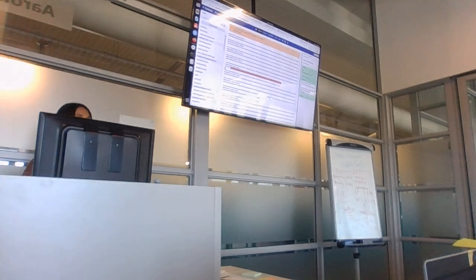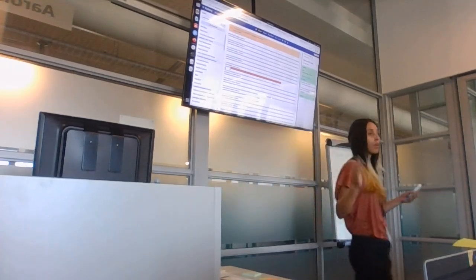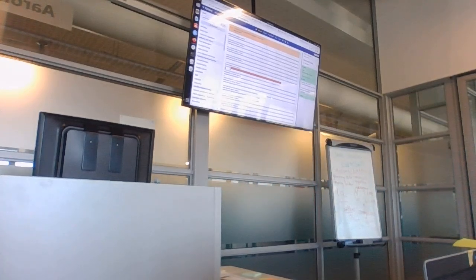So it's going to take all the reads. It takes long. I mean, if it was one, it would probably run through it. It's taking all the reads and it's comparing. So maybe it's my English, I don't know. Maybe it's my English. I think I actually understand what you're asking.